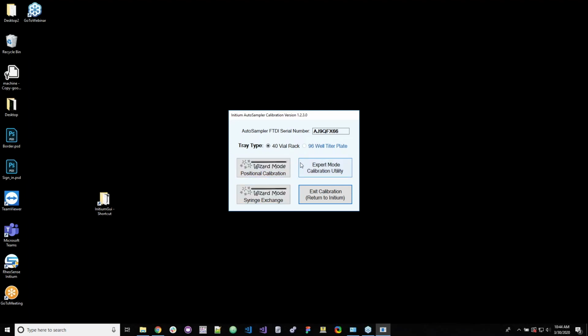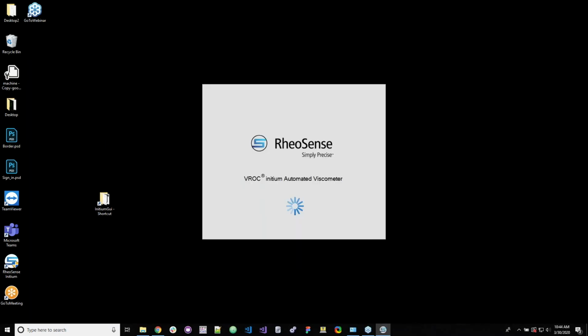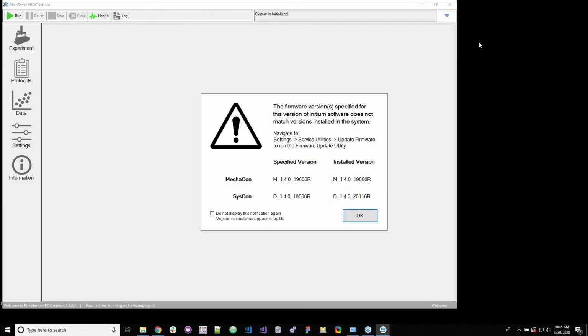Okay, delete this. All right. Maybe I won't go through that because it takes forever to initialize everything once you go into that wizard. It now has to reinitialize everything again because we clicked that autosampler thing. Still delete. Don't save this. Especially this part. This will freak them out. Don't save that part.